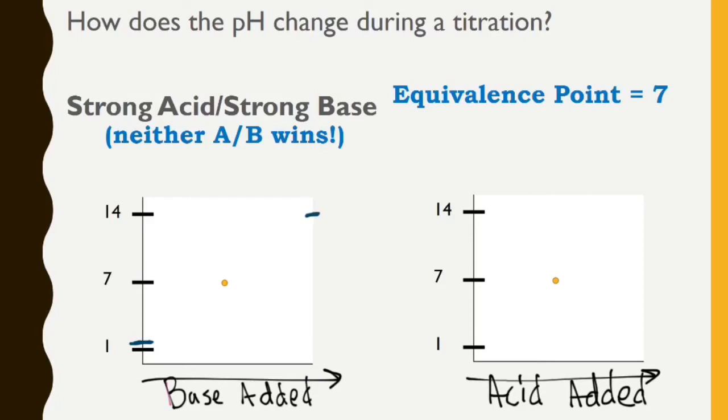Now, this isn't going to be a straight line graph. What actually happens is that these pH changes start off kind of slow, and then they're going to shoot up, and then they're going to be kind of slow again. So we have this kind of S-shaped graph here. And normally, if you were trying to find the equivalence point, you'd graph all of your pH data that you're measuring throughout this reaction and then find the midpoint and look at where that pH is. So this lies right about 7, but that's what we were aiming for.